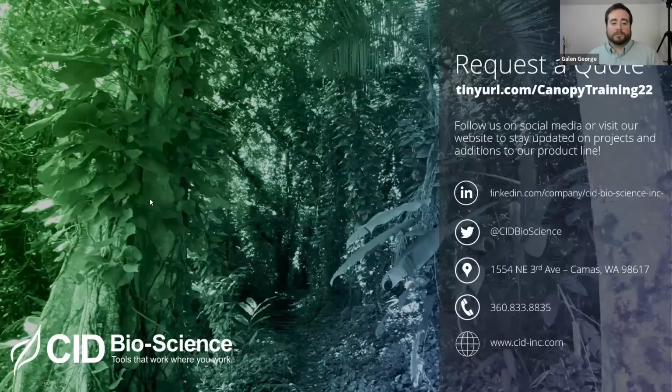So we talked about unboxing the instrument, all the things that come with the instrument. We dived into the actual features of the instrument, how to take measurements, the proper procedure for making sure you're aligned north, make sure that when you're holding that trigger down to get your live image, you're adjusting your exposure properly by using the left arrow for automatic, and then also using the up and down arrows for increasing or decreasing exposure.